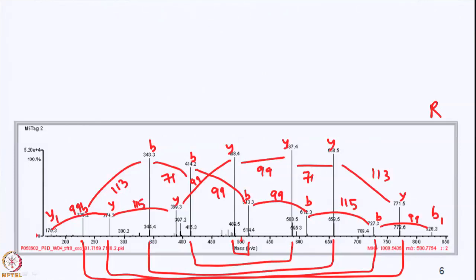Valine. Let's do one other thing. This is mass 1000, sorry. Can you read that? That's not a fake peak. We know that is reasonable because we measured the precursor mass before we did the MS/MS spectrum. The precursor mass is 1000. If it's 1000, we can go from here with 129. Precursor mass is like a Y-ion. It's like the last Y-ion.